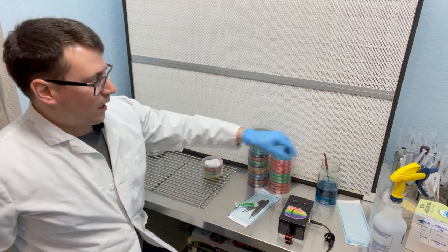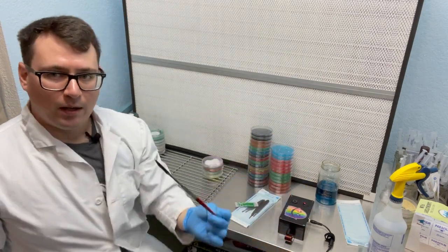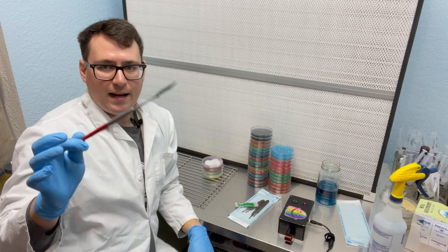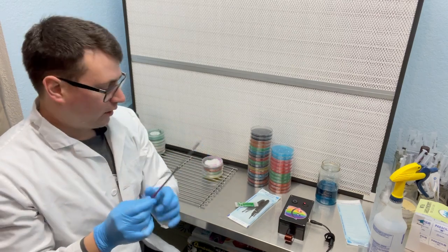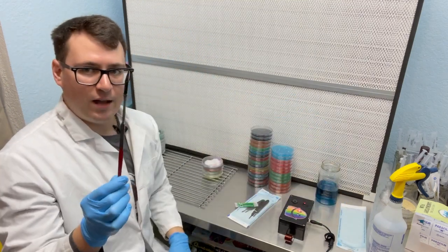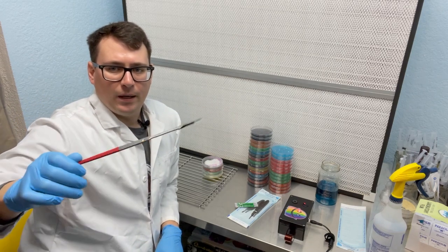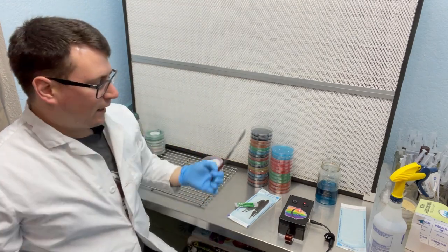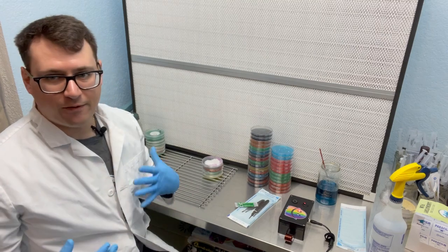That being said, I did a video reviewing this Lab Rats mycology scalpel about a year ago, and I really enjoyed using this blade. However, it's covered with some kind of silicone, and I was always afraid of running it through the pressure cooker, and it also didn't fit in my pouches. So I steered away from using these Lab Rats blades, but if you go back, there's a video that I did about a year ago on these blades and also utilizing this disinfectant here. It's a little bit of a different technique.